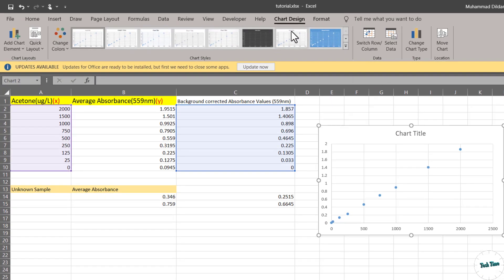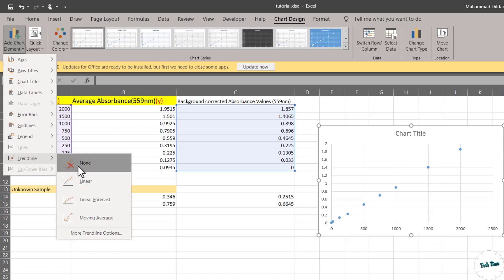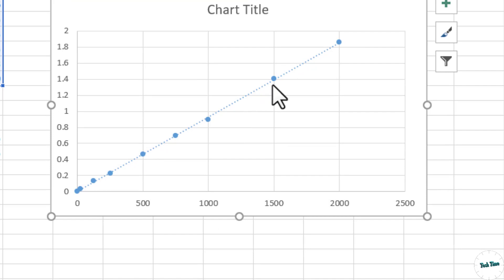Next, you can go to chart design and on the left side we have add chart elements. Scroll down to trendline and click on linear. We have a linear trendline inserted in our chart.